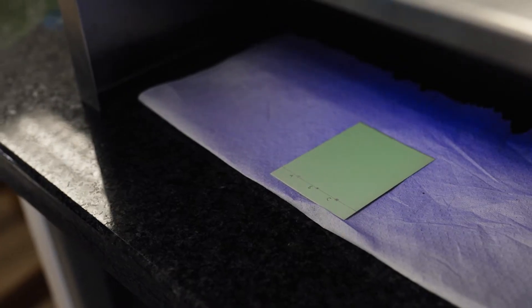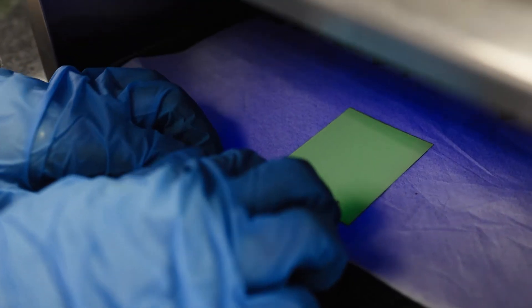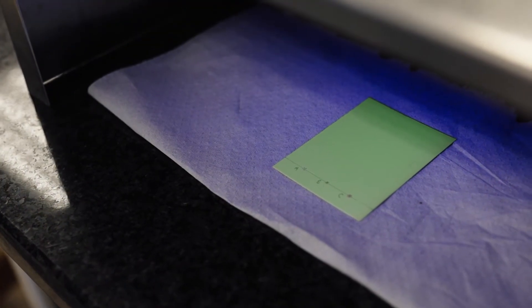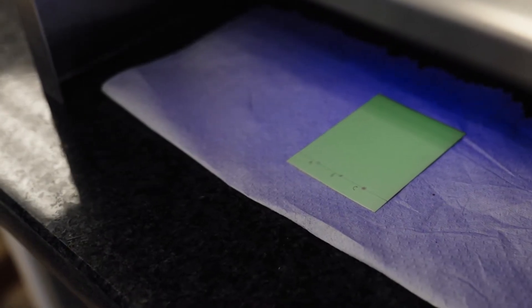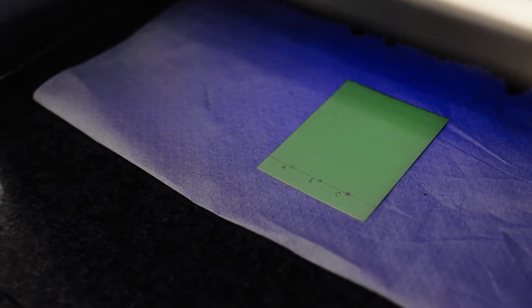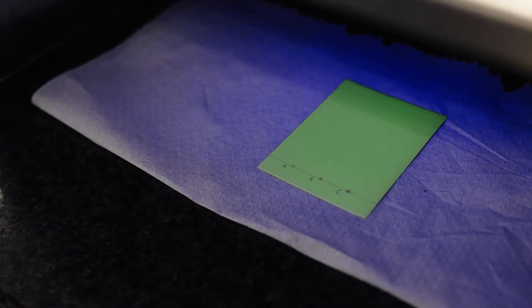Before we run the TLC plate, we're going to use a UV light to confirm that we have spotted everywhere. You can see that there are dots at each one of them. The salicylic acid is a bit lighter than the rest, and we'll also be able to see it when we run the TLC plate.